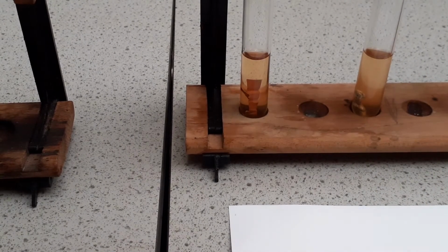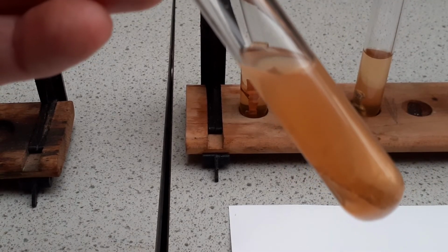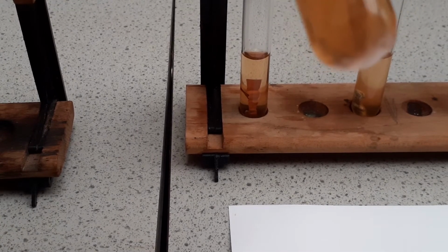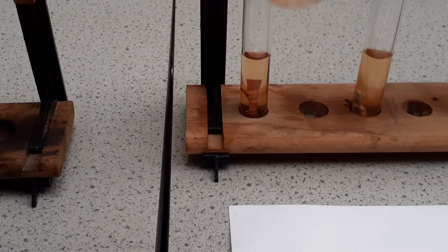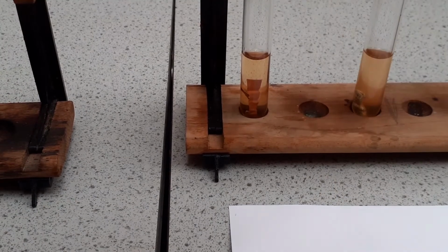And if we look at the magnesium, as you can see, it's fizzing away, showing there's a reaction occurring, and also we've got a deposit on the bottom, and the piece of magnesium is actually getting darker, so there's a reaction occurring there.